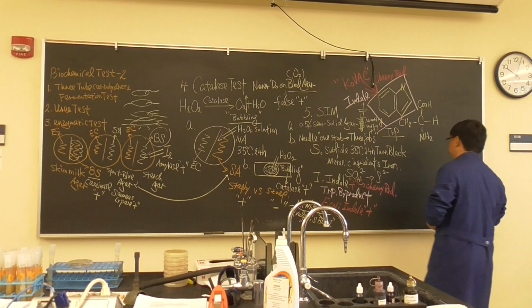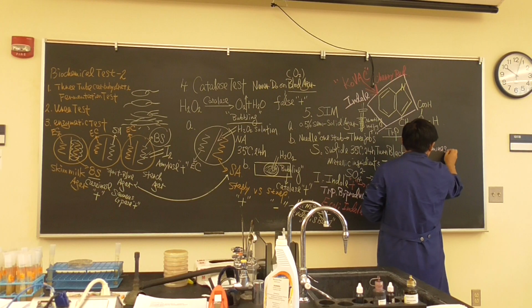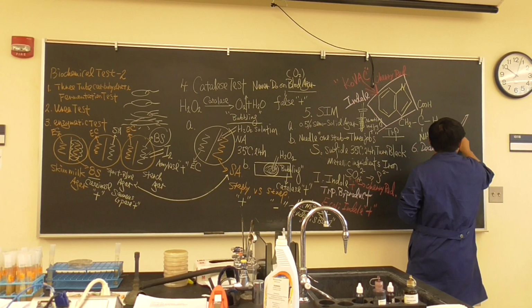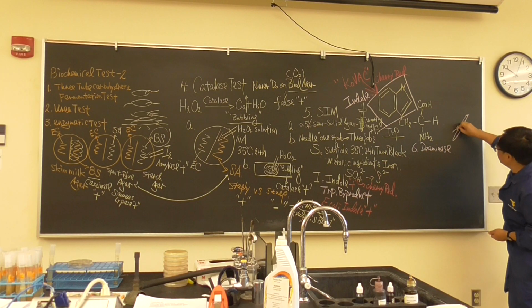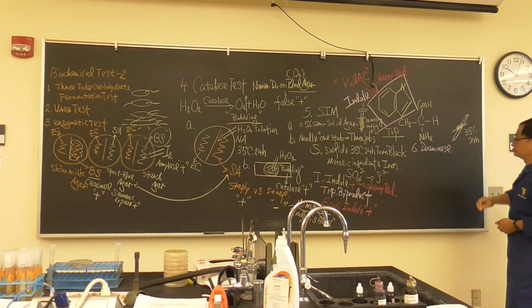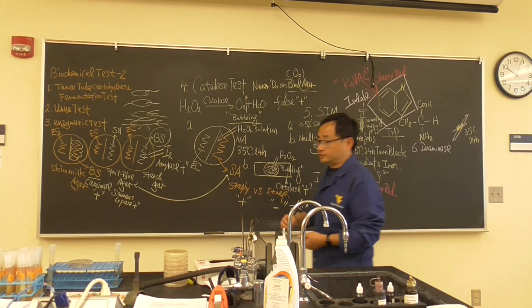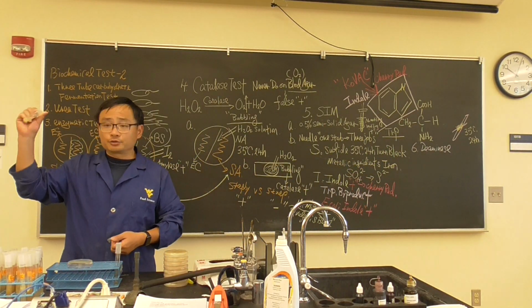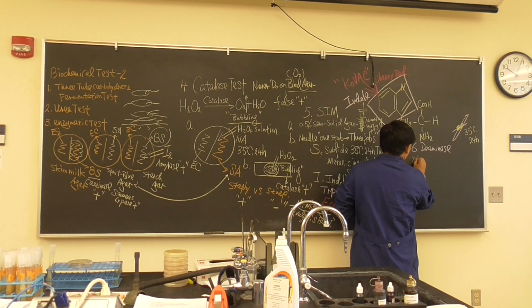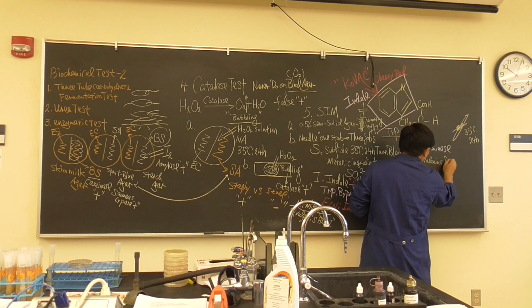Okay, last test today, the deaminase test. For the deaminase test we're using slants. This slant looks easy. You inoculate the bacteria, let it grow at 35 degrees Celsius for 24 hours. What's the story? This is a very special slant. It's not a slant that looks similar, but the ingredients are different. What is this one called? This is called the phenylalanine deaminase test.